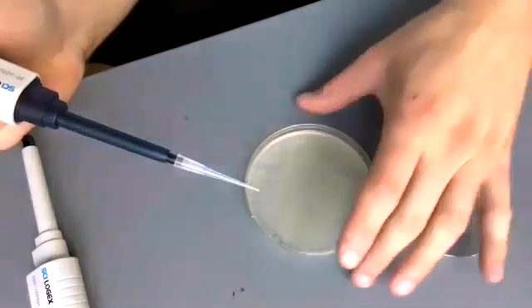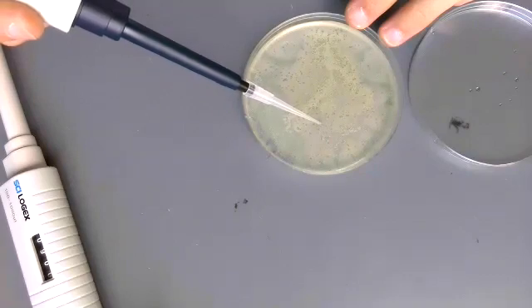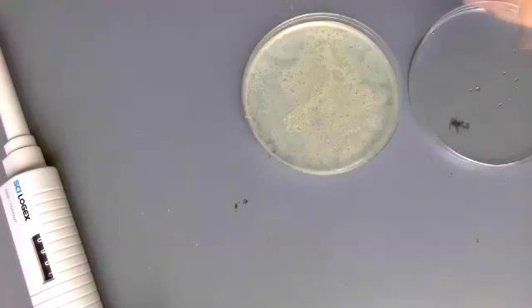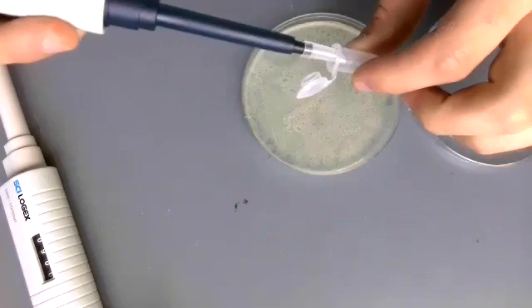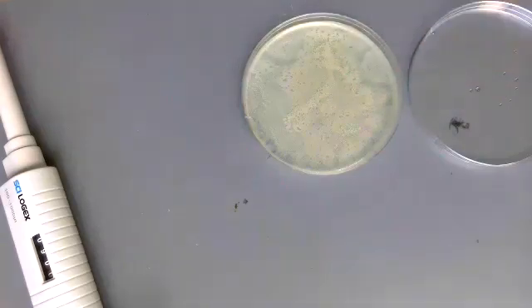So here I have the plate open. You might be able to see where I have the circle on the back side of the plate — here's where the plaque I wanted to pick was. I'm going to just very lightly touch the top, and you don't really want to get much bacteria or take any agar with you. Then you take your sample and kind of swish it around in the phage buffer to resuspend the phage within the buffer.